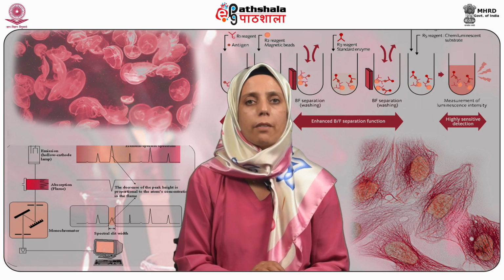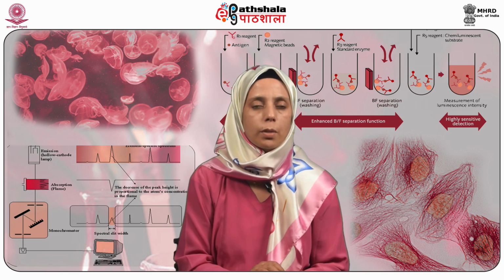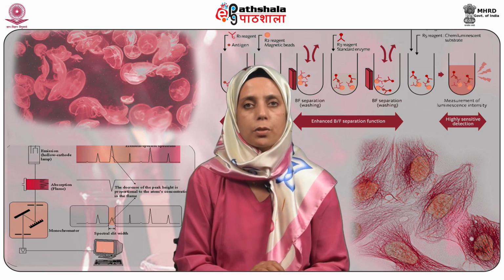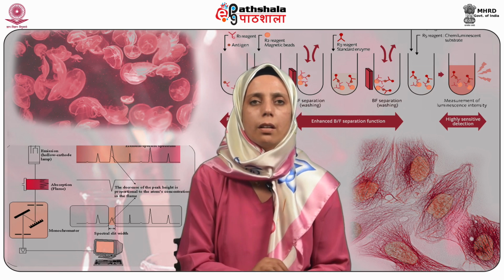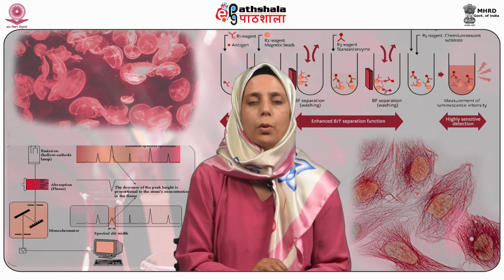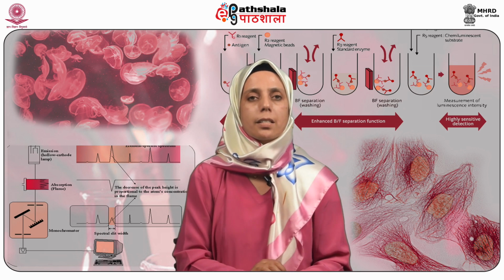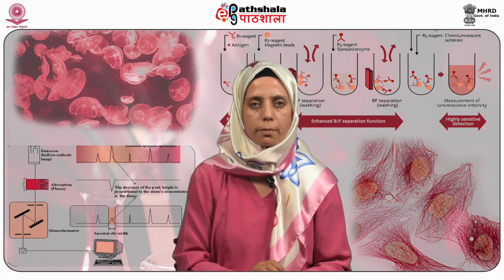Interference wedges are available from the visible range, 400 to 700 nanometers, the near infrared region, that is 1000 to 2000 nanometers, and for several parts of the infrared region, 2.5 to 14.5 micrometers. They can serve in place of prisms or gratings in monochromators.